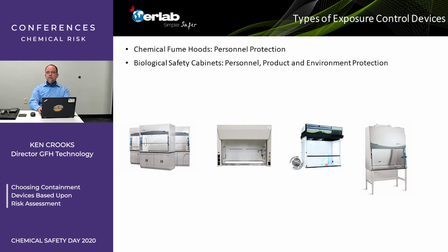Biological safety cabinets offer both personnel and product protection plus environmental protection because they're HEPA filtered internally. And that's for the use of biological hazards only. This is not a chemical fume hood. And a chemical fume hood is not a biosafety cabinet. They are two completely different animals. Even if they're both filtered versions, they have different uses for different hazards.